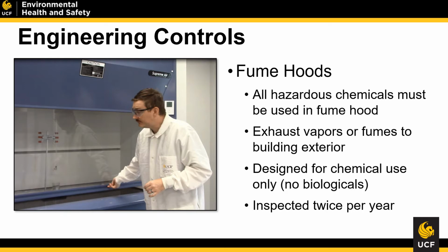Fume hoods, again, are used for hazardous chemicals. We wouldn't want to use biological materials inside of a fume hood because we would then exhaust those pathogens into the surrounding environment, which, for anybody on the outside of the building, probably wouldn't be the best situation for them. We want to maintain everyone's health and safety. So when you use a fume hood, please make sure that you're only using chemicals within it.